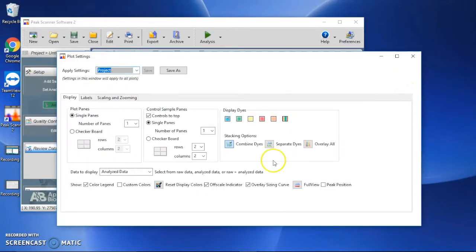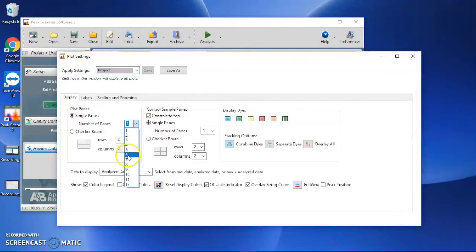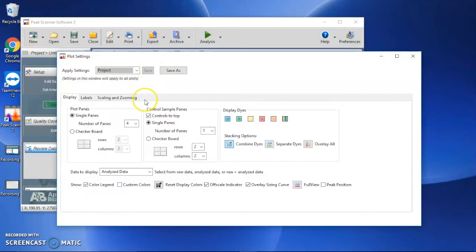Update Number of Panes. For example, I choose 4 here. It will display 4 samples in a view and print out 4 samples in one page.